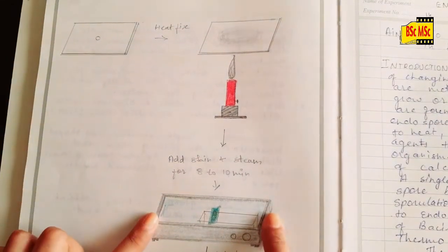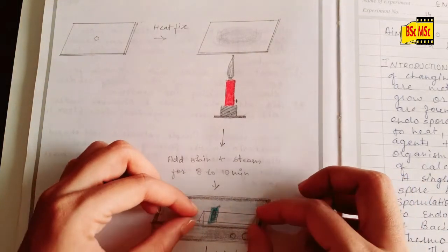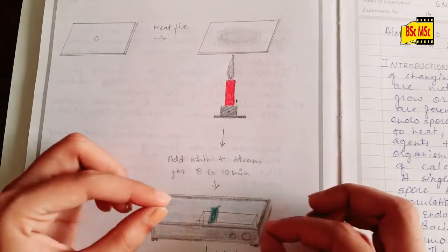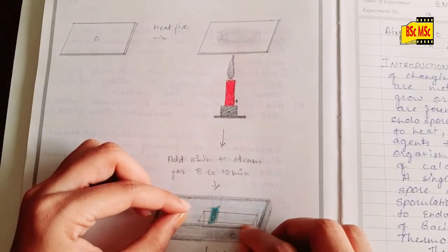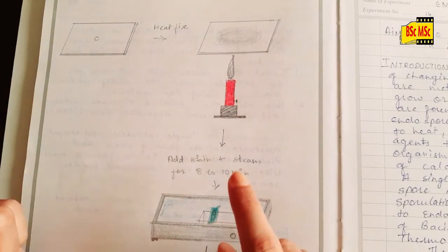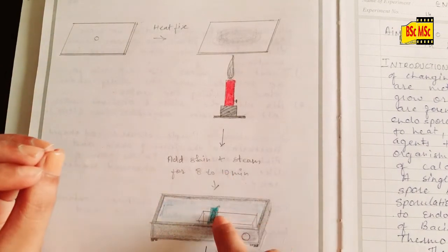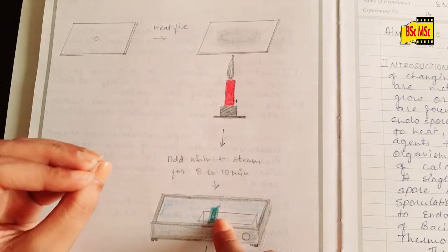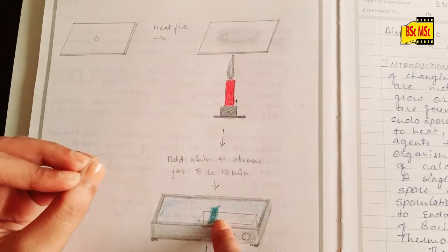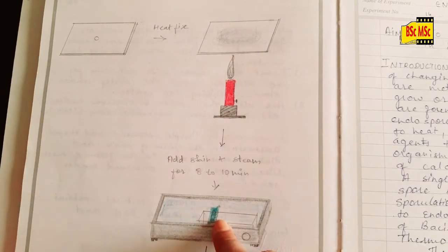This is the water bath, and you need to keep the slide on the staining rack which you have kept over the water bath, and then flood the slide with malachite green for 8 to 10 minutes continuously. Do not let it dry for any second. Continuously flood the slide. So what happens when you add the malachite green? It penetrates under the spore coat.